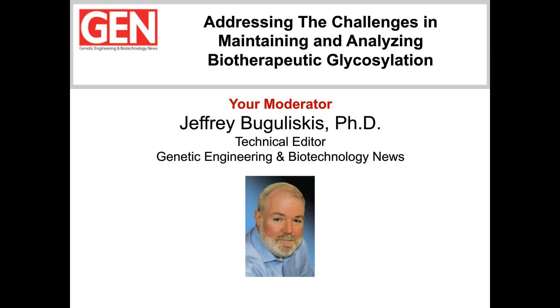Minimizing batch-to-batch variability in product profiles while maintaining in vivo safety and efficacy remains one of the biggest challenges for the biopharmaceutical market. As the market for biopharmaceuticals continues to grow, manufacturers are increasingly challenged to improve process efficiency and develop methods that streamline workflows. Mandates from regulatory agencies, such as the FDA and EMA, require biopharmaceutical manufacturers to demonstrate comparable glycan profiles of critical quality attributes such as heterogeneous glycosylation patterns, setting up a daunting standard for product analysis and consistency.